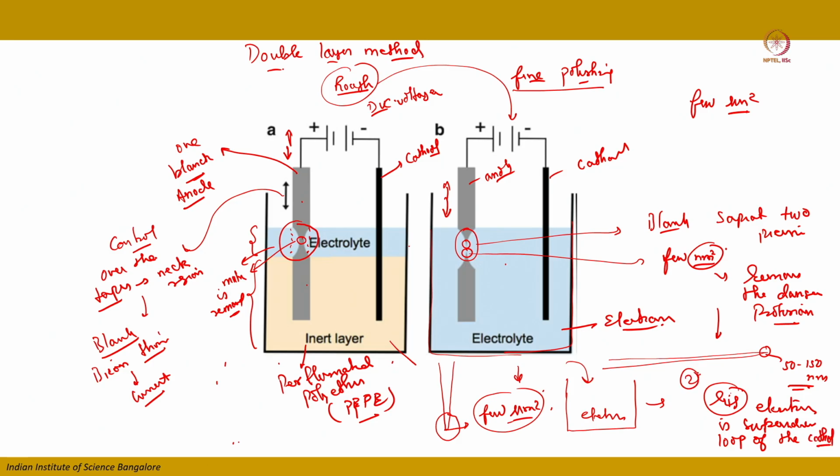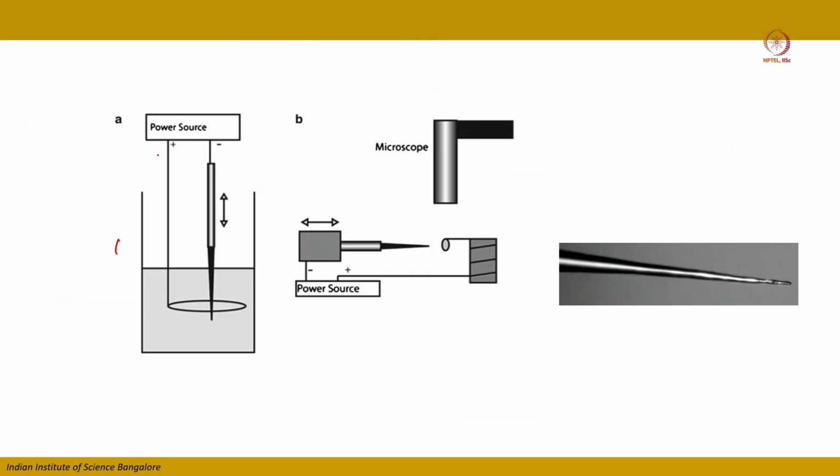After preparation of a needle specimen using the electrochemical cell, this rig is nothing but a platinum wire, bent in such a way that at the end it looks like a circle, or a wire loop, and at this loop, due to surface tension, you can deposit an electrolyte.